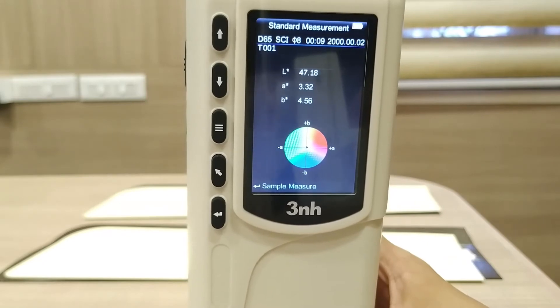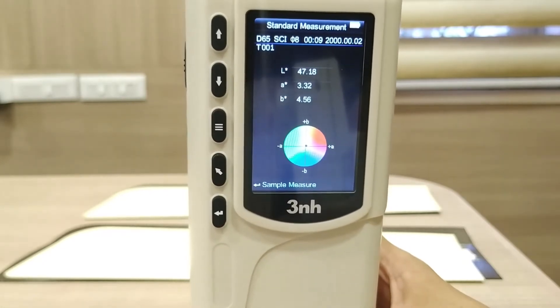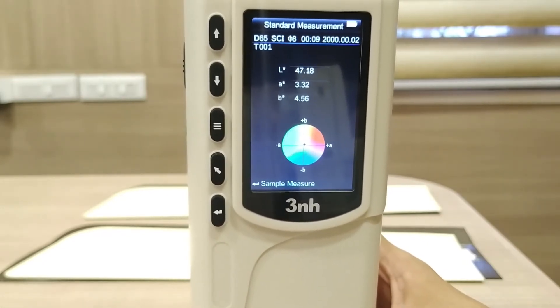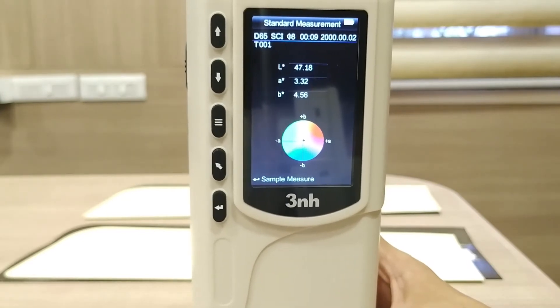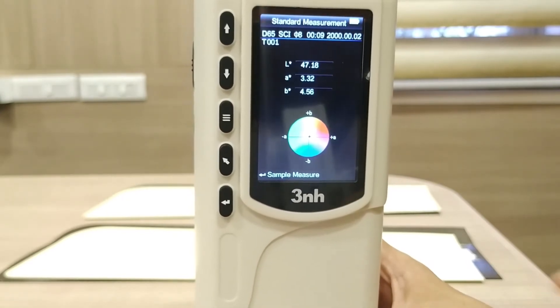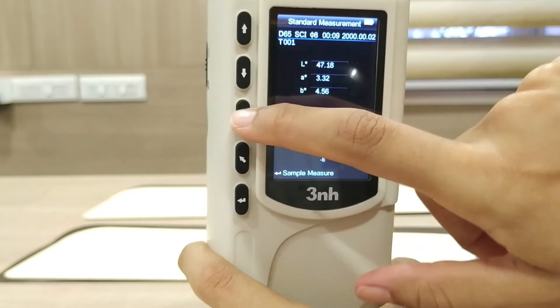In this instrument you can also set tolerance levels which will automatically indicate whether your sample has passed a failed test. To set tolerance levels, click on the menu button. Here you have an option called tolerance.